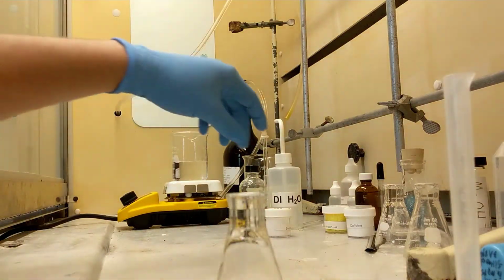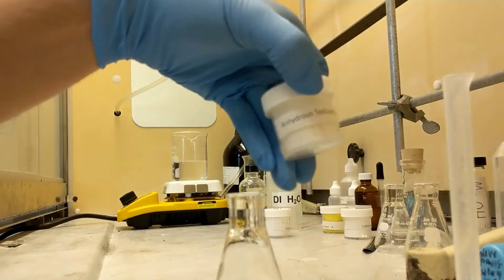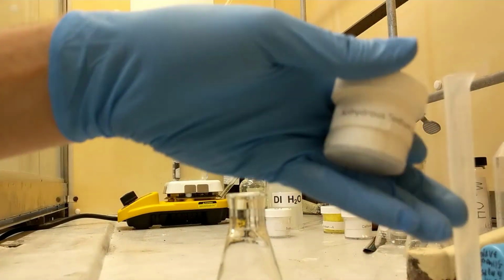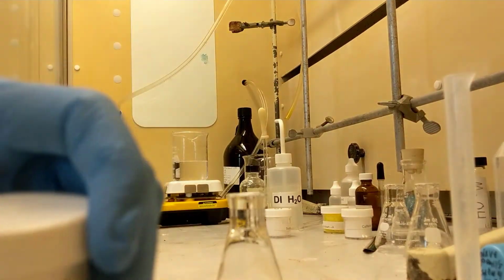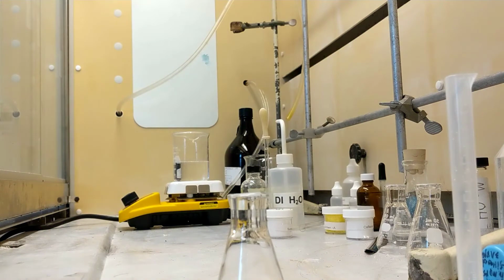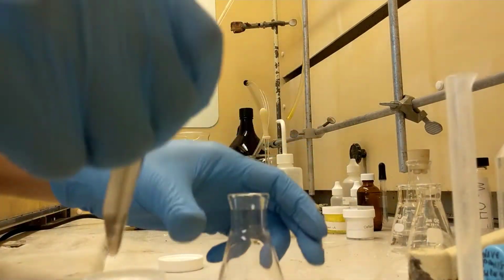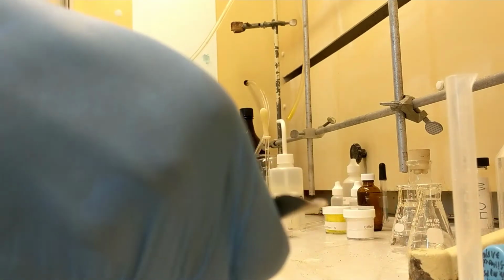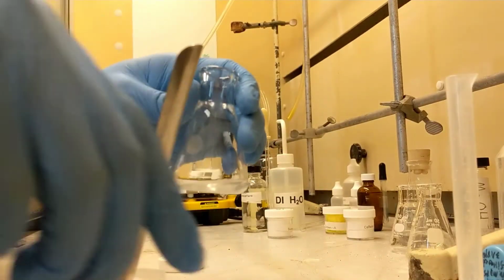I'm just going to add my drying agent, anhydrous sodium sulfate until it doesn't clump anymore, really. But I don't think it'll take long to stop clumping this one. This looks pretty dry. Just going to use my scoopula, boom, add a little bit.